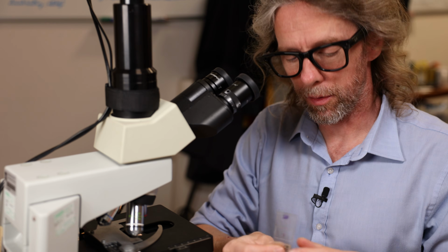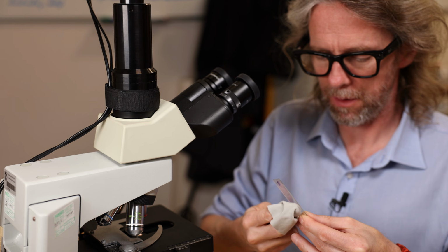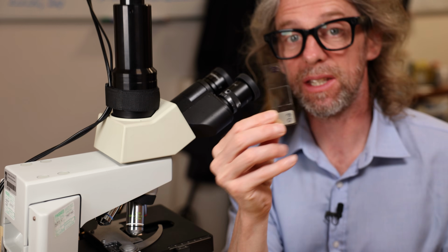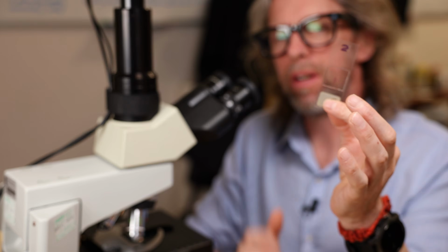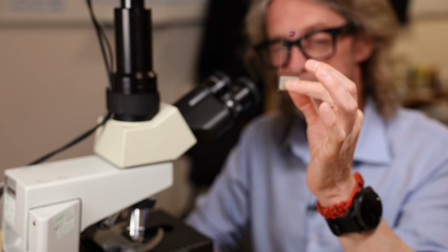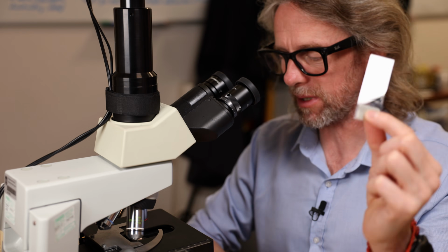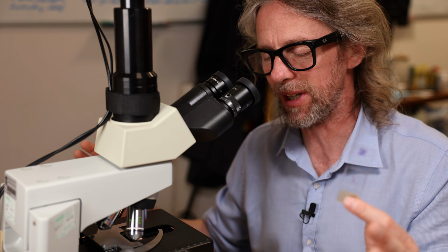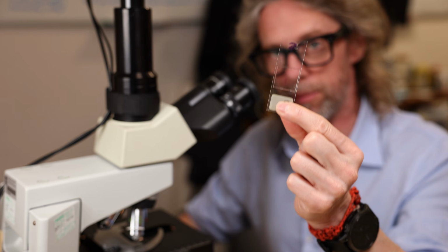Right, I've got two slides, and obviously the stomach is a lot bigger than the esophagus. So this is just a bit of the wall of the stomach. Now this is the body of the stomach. I've got another bit of the stomach here. I've done another video on the anatomy of the stomach, but the stomach is mostly body, but it's got different bits, and in different regions of the stomach it will be a little bit different. We'll find slightly different cells there doing slightly different things, but the histology of the stomach can get really complicated, and we'll see why. It's actually quite simple, but it can get quite confusing, so we'll try and keep it simple, right, because that's useful.